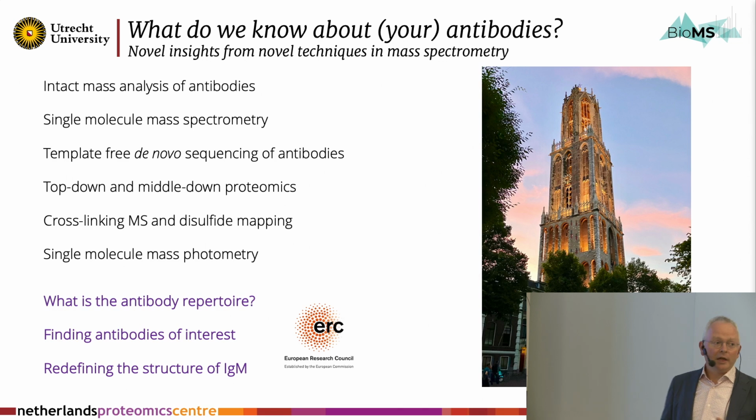Also on getting rid of DNA. Can we do de novo sequencing? Can we read off sequences of proteins without a DNA template? And also some other techniques that I mentioned over here. But that accumulated in what I'm going to talk about now.